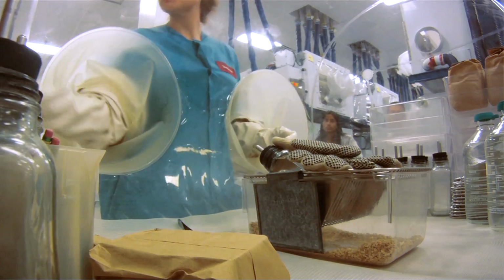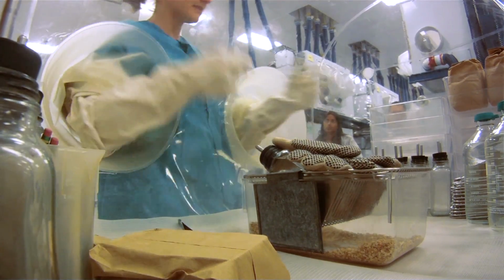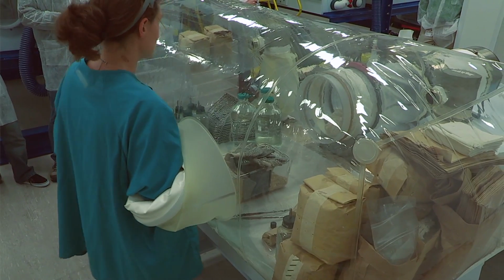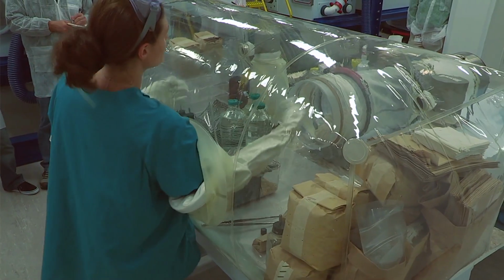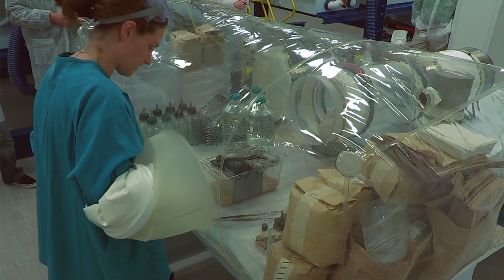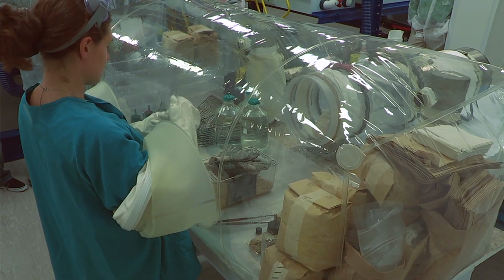And then I'll just swab some of our packages that we just brought in and some of the water bottles. And then lastly, the floor, and you want to take care not to get any sterilant on it. Lots of times when you just pulled in a cylinder, there'll be some sterilant puddled up there. So just make sure that you're avoiding that. And you can go ahead and stick this in.